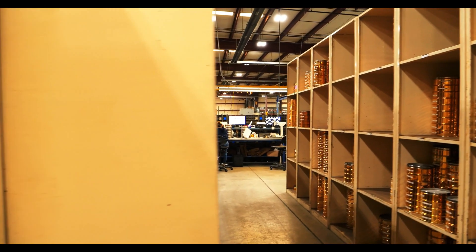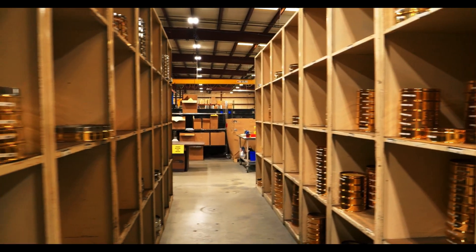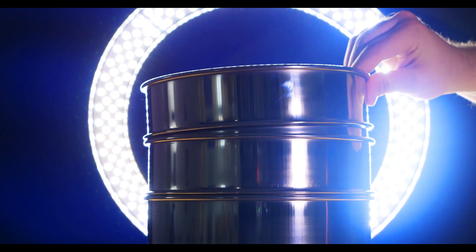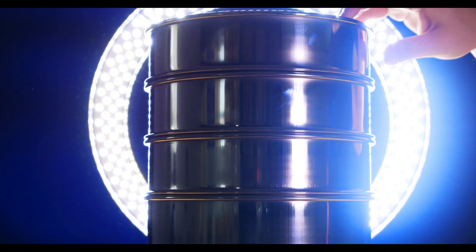Most components used to construct our testives are produced in-house, so the process can be controlled all the way through. As a result, we can typically have your testive order shipped within five business days if the raw material is available. All the components are pre-made and stored so that when your order comes in, all the components needed to construct your desired specification can just be pulled from the shelves.